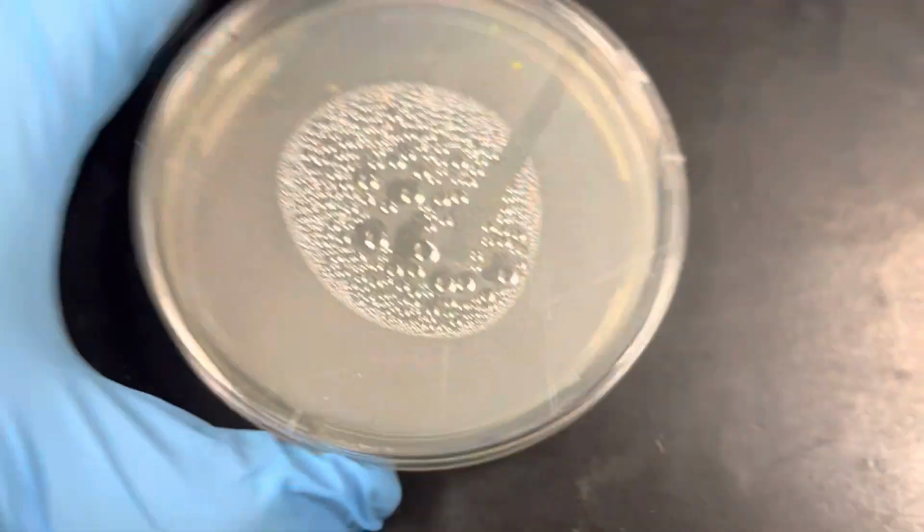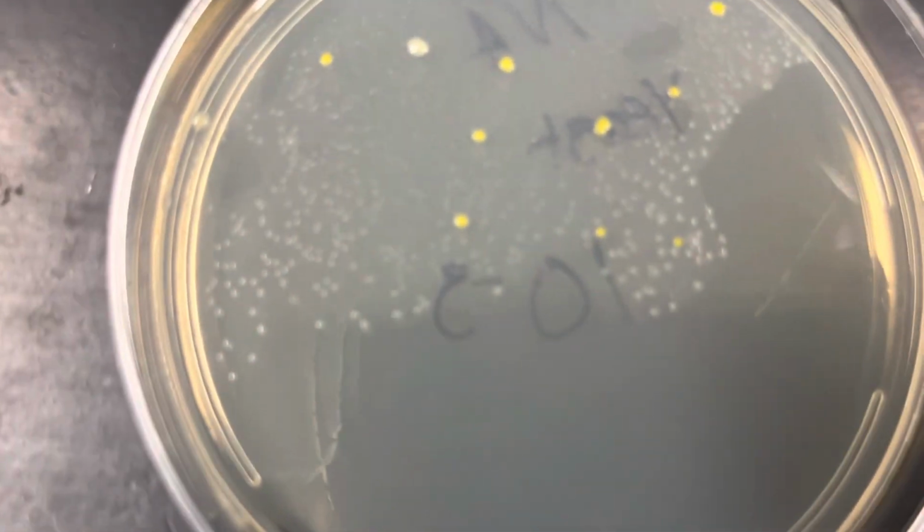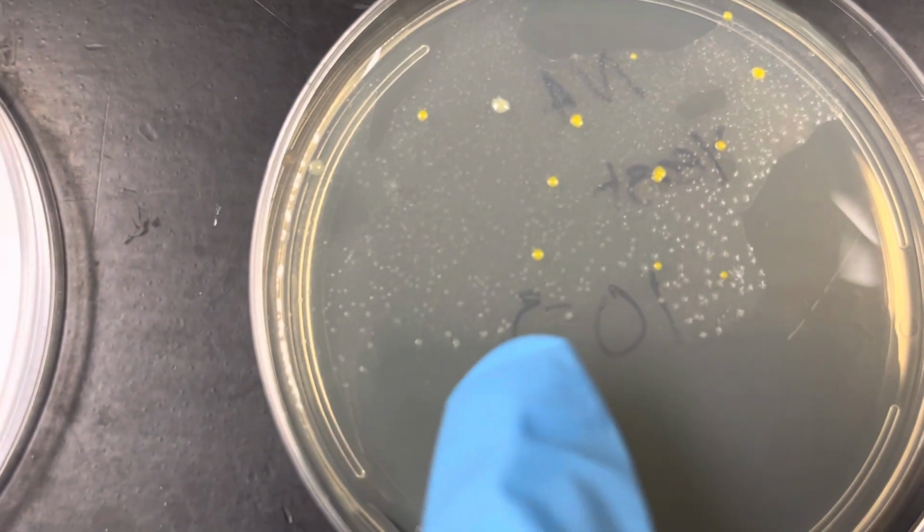So now as you go through each dilution, you should see that it's much easier for the 10 to the -3. You can see even more separate yeast colonies. Almost look like little stars in the night sky, I don't know. 10 to the -4.